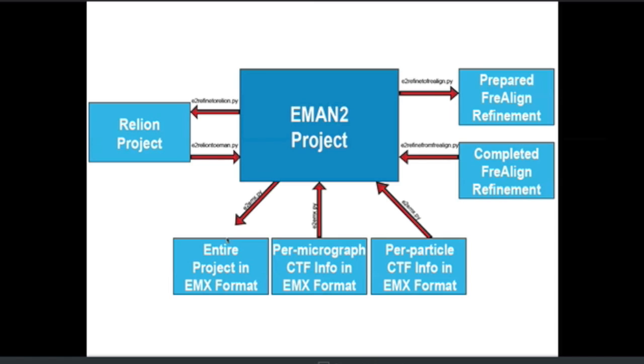Similarly, for FREALIGN, you can export data in FREALIGN format. It handles all the data format conversions, all the metadata conversions, everything, so you can get started immediately. There's also an emerging standardization effort in the CryoEM community called EMX, for EM exchange format. And this is endeavoring to have a standard format for metadata exchange among software packages. It's still in sort of its fledgling state at this point, but we're fully supporting and committed to that effort as well.